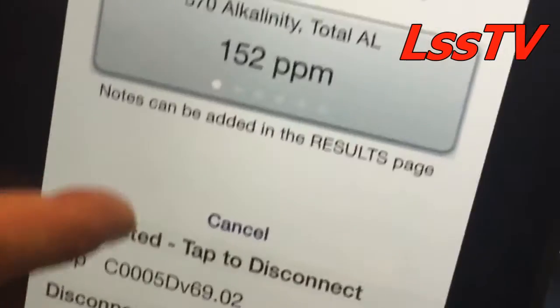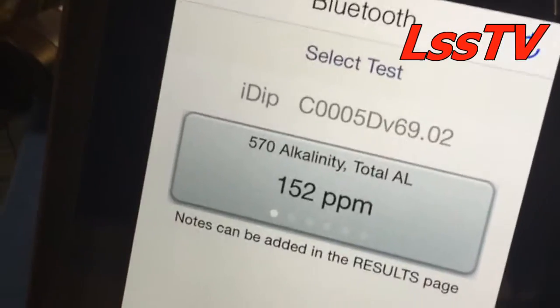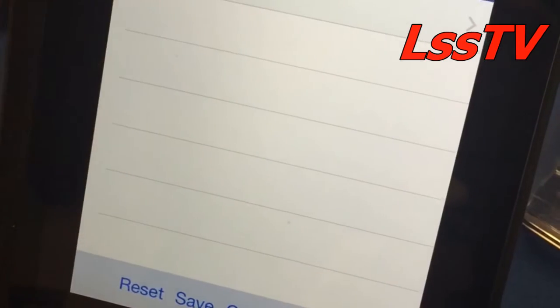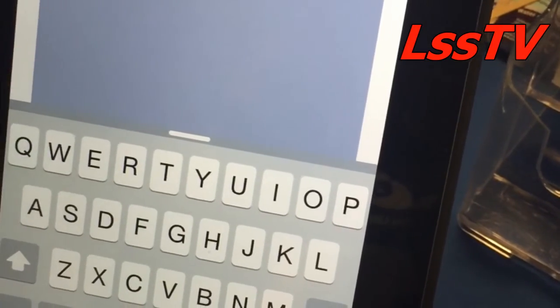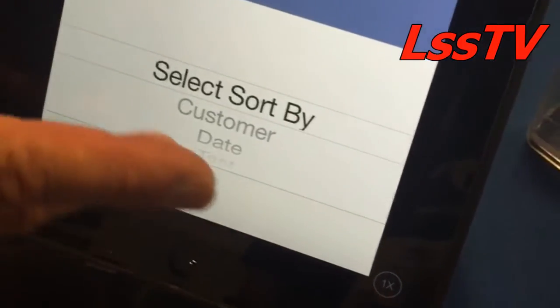It sends the signal over to your smart device, and there it is — no transcription errors, none of those problems. Let's take a look at the results. Here it is — this is our customer, Marine Aquarium. Here are the results. If we're happy with them, we can even say good, bad, or whatever we'd like. We have a note now. If we're happy with the results, we can save them, and that saves it forever unless you delete it.